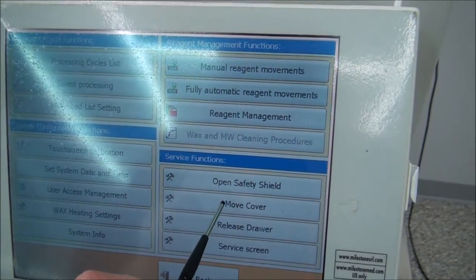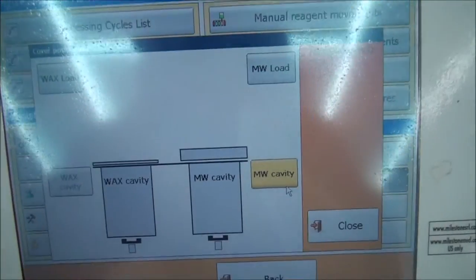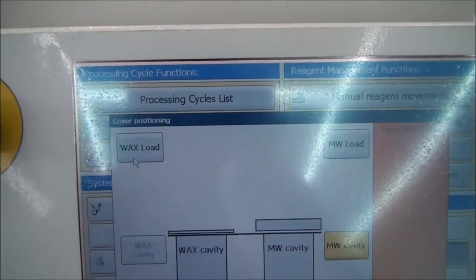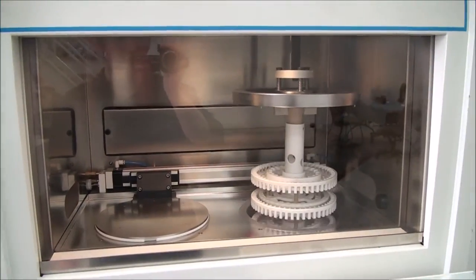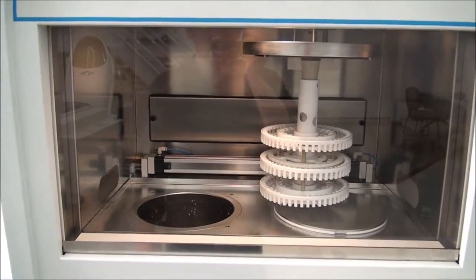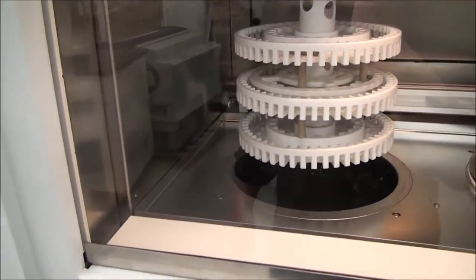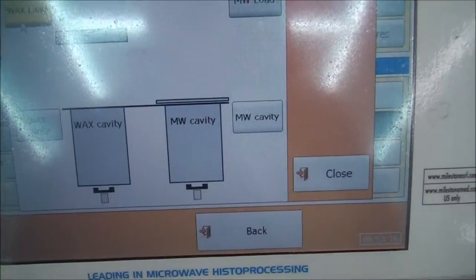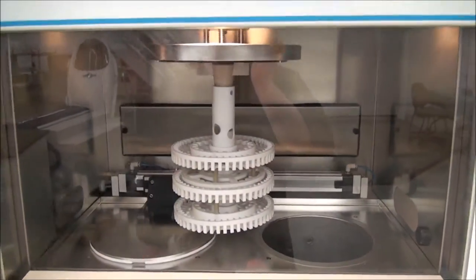Similar to the safety shield, to change the position of the cover, touch the Move Cover button on the main screen. A new screen will pop up that shows the different positions that can be selected for the cover. I have sped up this part of the video. I am not able to lower the racks into the wax chamber because we do not have any wax in the cavity and the system must detect that the wax is melted. To return the racks back to the microwave chamber, touch either the Microwave Load button or the Microwave Cavity button.